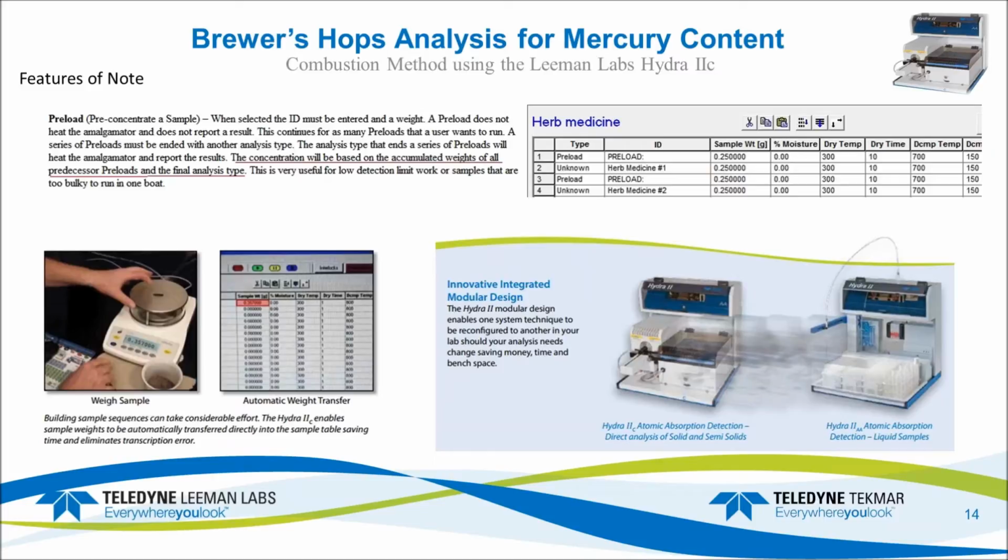Also, just a quick note, if you are interested in running samples of this nature and you already have a Hydra 2 instrument, there is a transfer kit where you can simply change out the bottom of the analysis. The actual detector head above is where the cells live, and you can just change how you introduce the sample, liquid or solids.